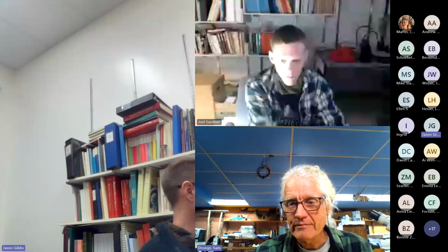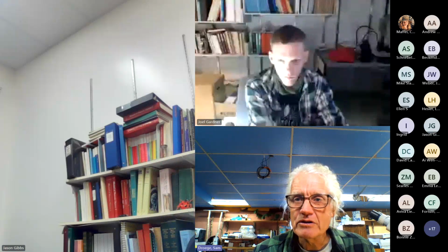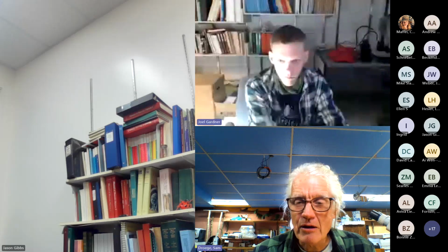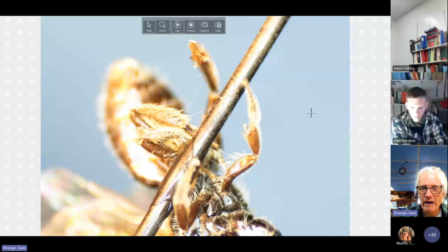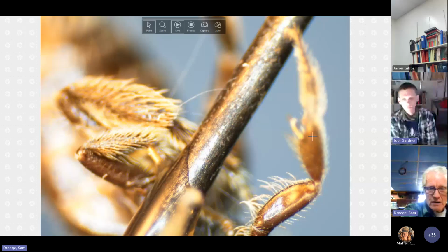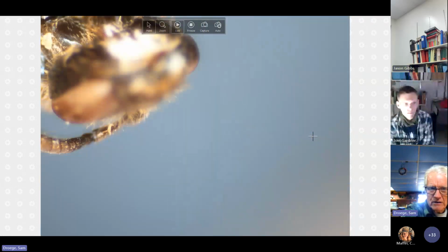I have a trochanter on deck. It's actually oblongum because I couldn't find a specimen that wanted to show its thing there. So let me move to share. And this is pretty oblong. They all should be pretty standard. Like most of the trochanters are going to look like this. Moving up here. Did I just share or did I not share? Yeah, I can see it. Okay.